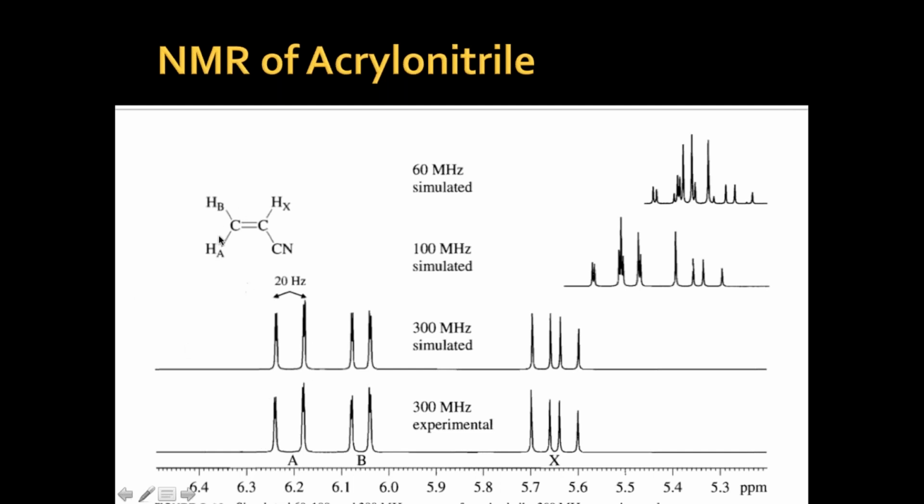What does that mean? So how do the peaks show up in NMR? You have a proton that is coupled with another proton. So n plus 1: how many protons you have in the surrounding, plus 1, that many peaks should show up in your NMR. Means HA must show two peaks, because there is only one proton in its surrounding, which is HB.